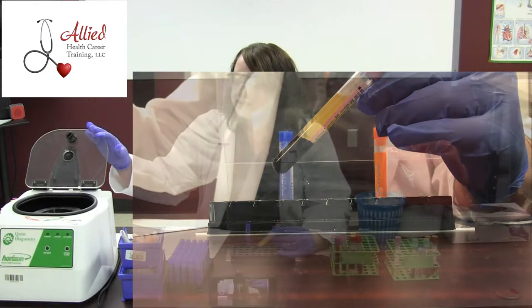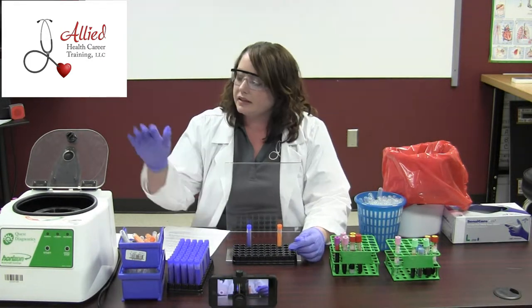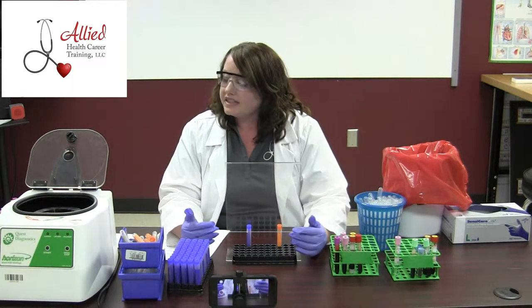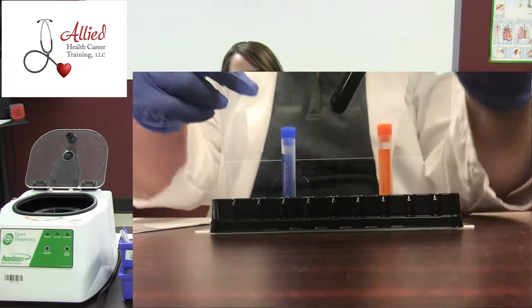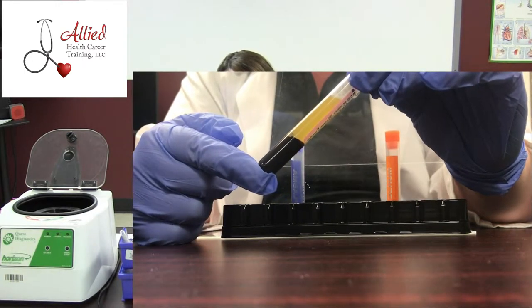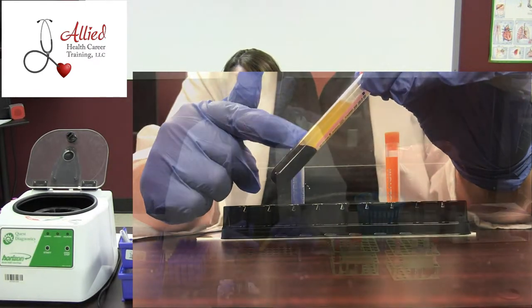That's when we use our centrifuge. If we put a specimen that has anticoagulant in it into the centrifuge, what it's going to do is spin it really fast — about 2,500 rounds per minute. Then the red blood cells, because they're so heavy and are probably the largest cells in the blood, are going to fall to the bottom, and what's going to be left on top is plasma.